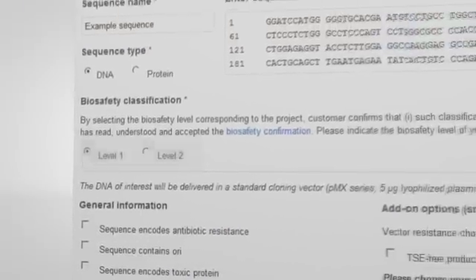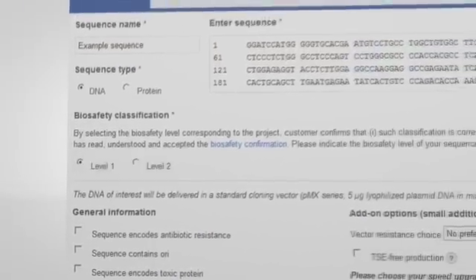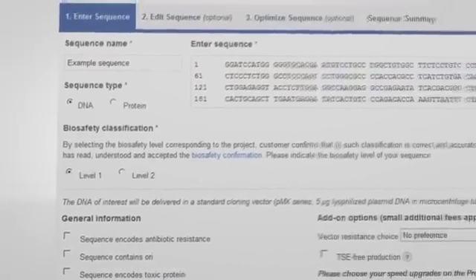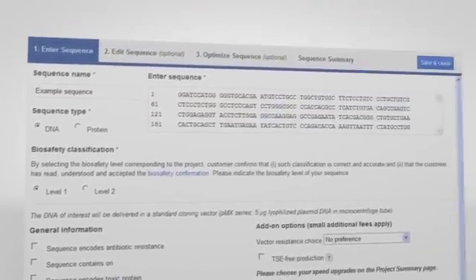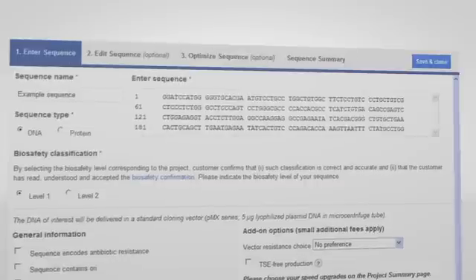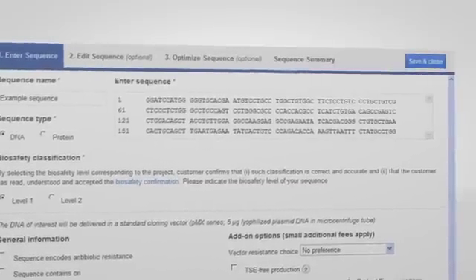Select the biosafety level for your project. You are now finished and you can proceed by clicking the save and close button.